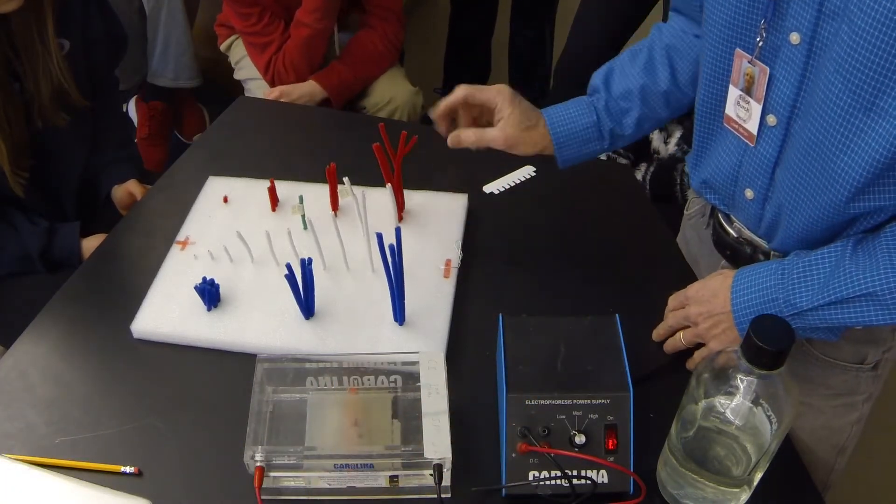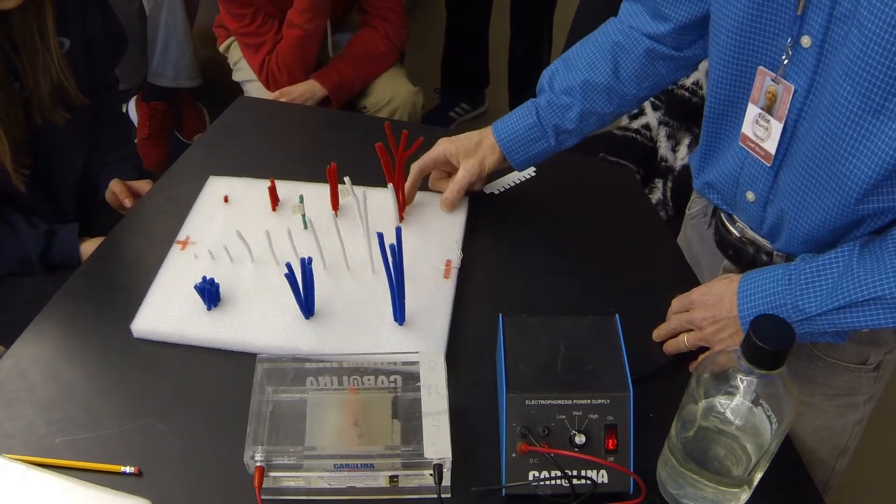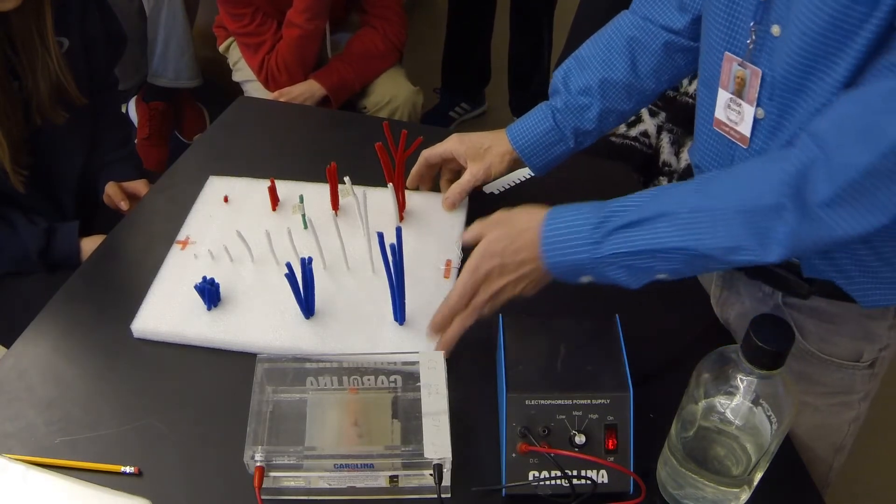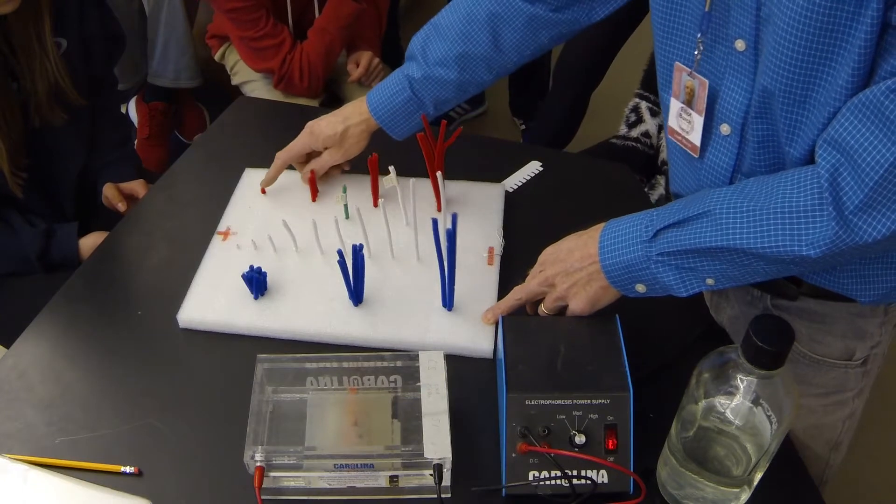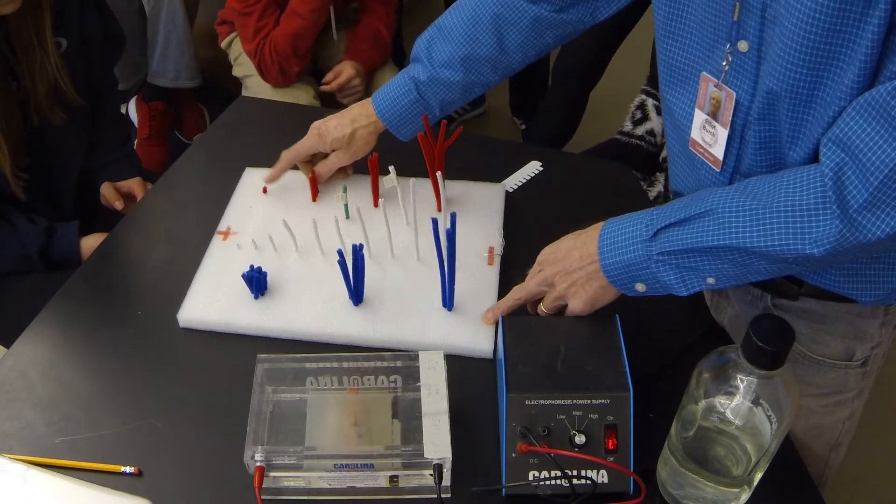This is Emma's DNA. The tallest ones only moved a little bit because they're kind of slow. The medium size a little further, the shorter further, and the littlest one went the furthest because they're really fast.